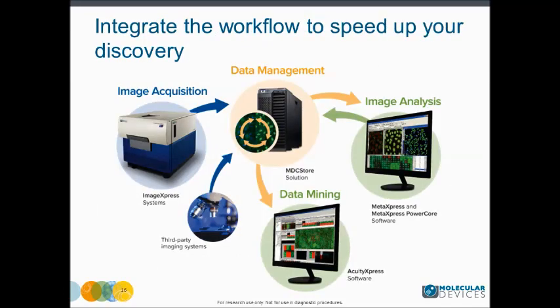Here's a pictorial depiction of what I just said. ImageXpress acquires images and stores them in a database where they are analyzed by MetaXpress, and the data is stored with the plate where it can be accessed by our data mining software called AcuityXpress for generating curves and identifying active compounds. In addition, third-party imaging system images can be imported into the database for analysis in MetaXpress and then data mining using AcuityXpress.